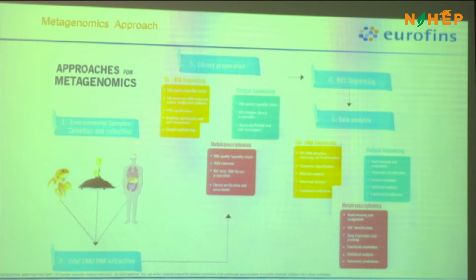When I'm reducing my search criteria to a smaller part, you are able to fetch a similar uniformity from all the organisms present there. When I do that, my abundance is better than having total DNA and trying to identify what is in it. Otherwise I will miss out the rare ones, the smaller microbes, because I have other stuff there also.